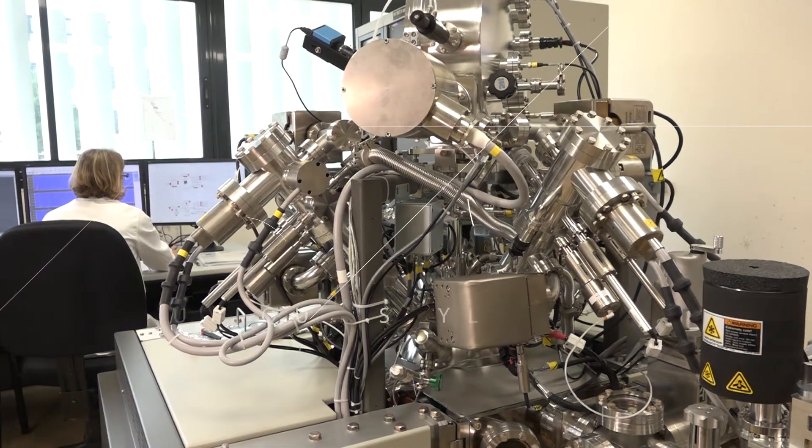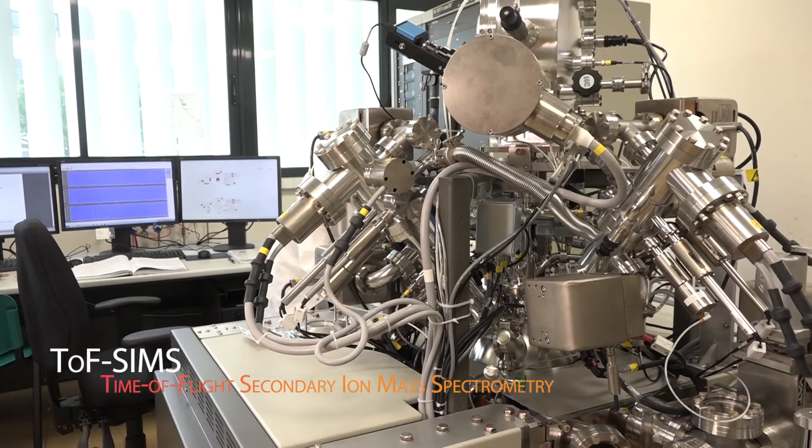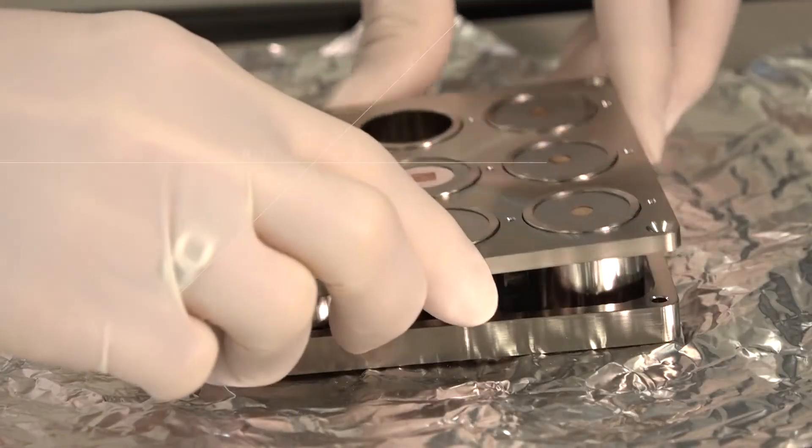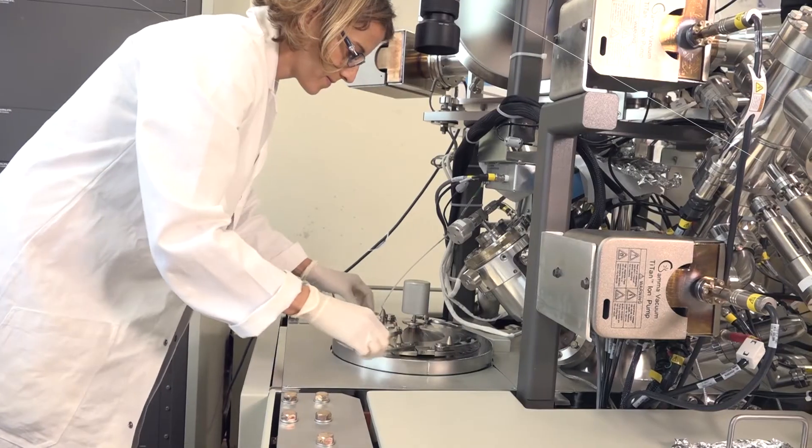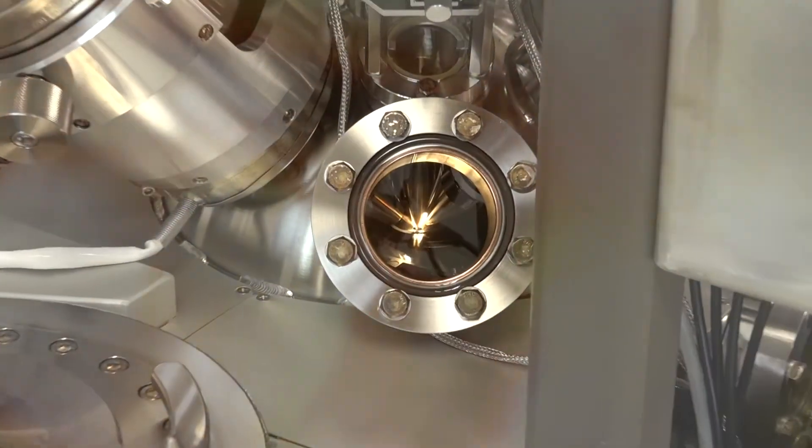The mass platform is equipped with a new state-of-the-art TOF-SIMS, time-of-flight secondary ion mass spectrometry machine. TOF-SIMS allows us to obtain elemental and molecular characterization of the extreme surface, the first two nanometers of various materials, with very high sensitivity close to femtomole.